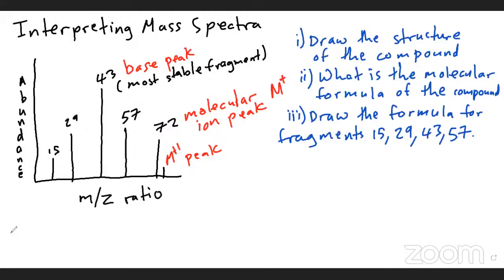you can get it for hydrocarbons, like this example, that's a hydrocarbon. You can get it for haloalkane, which we will do.